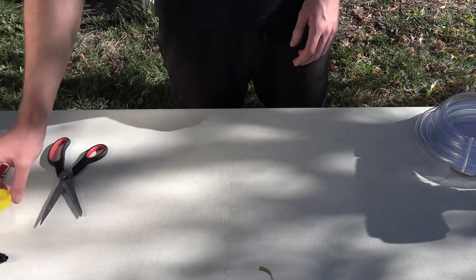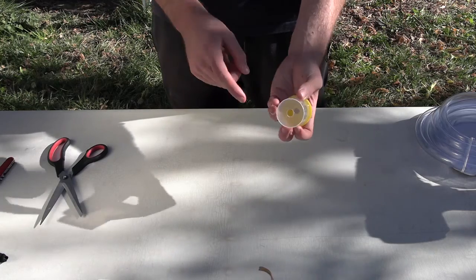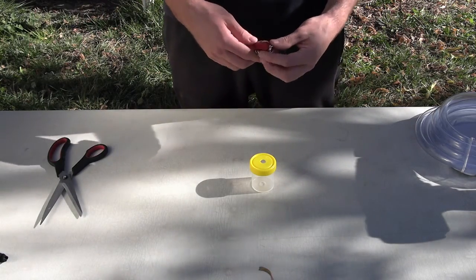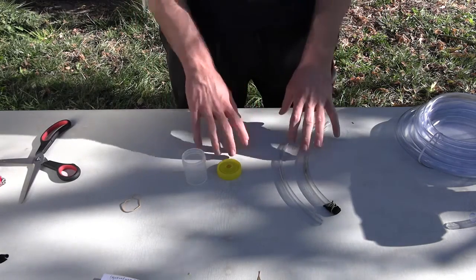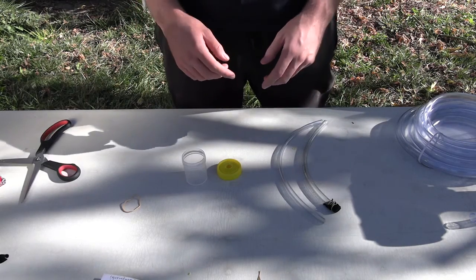Now we're going to get our container and make two holes on either side — one hole on the top and one hole on the bottom. Use a small knife and ask a parent to help you with this one as well. Once you have all your pieces set up and ready to go, we're going to start making the actual pooter itself.